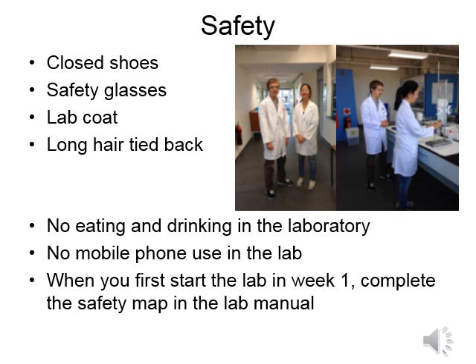There's also a safety map in the lab manual, which will help you identify all important safety features. You must complete this map and have it signed by a demonstrator when you first come to the lab before starting any experimental work.